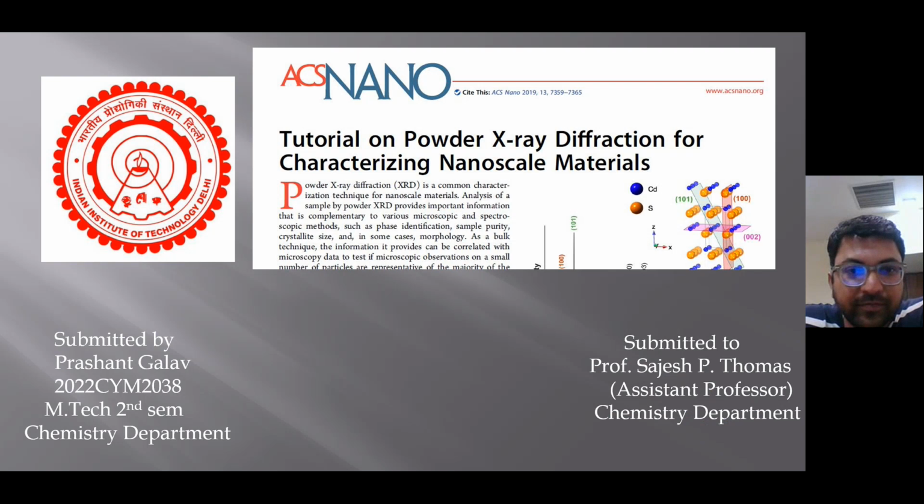Good afternoon, sir. Myself Prashant Galav, and I would like to introduce a new paper. This is a tutorial on powder XRD diffraction for nanoscale material.